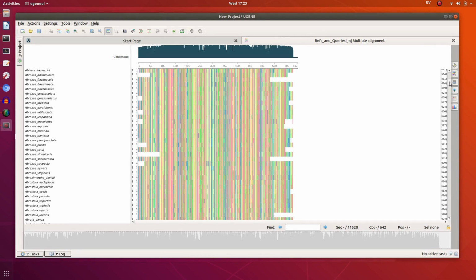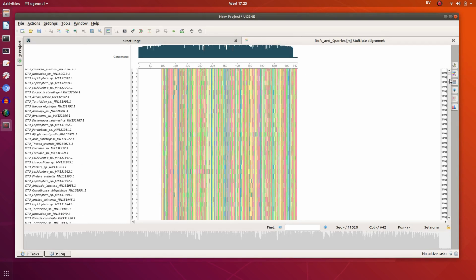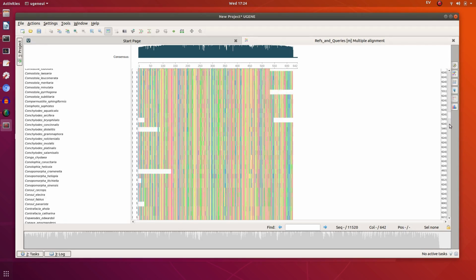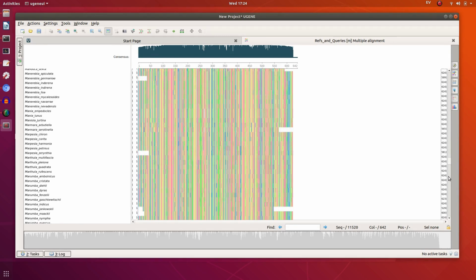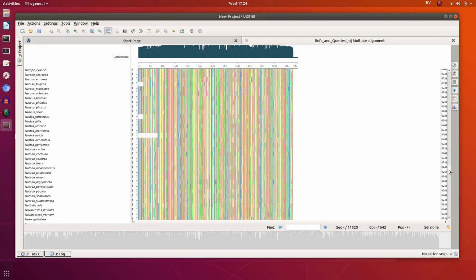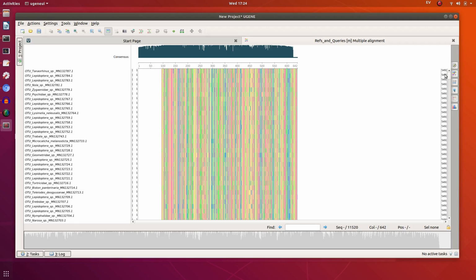And you can see this is perfectly aligned. So note the queries, incidentally, we have added a string OTU to the start of their names. This makes it easier to find them later. The queries are in the first part of the file, then we have all the references in the remainder. But note they're all in the same file. Some software for profile alignment will only include the queries in the output file.